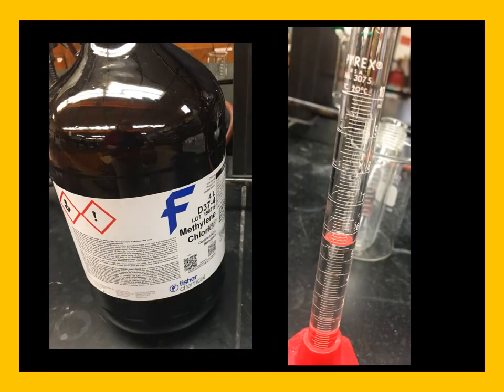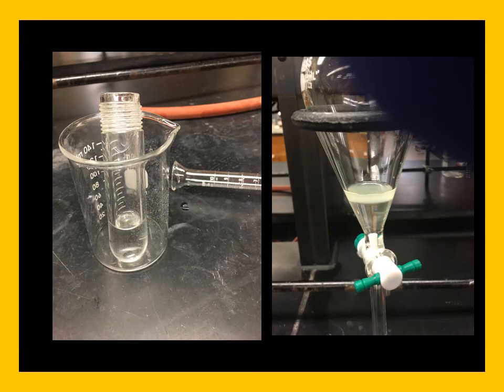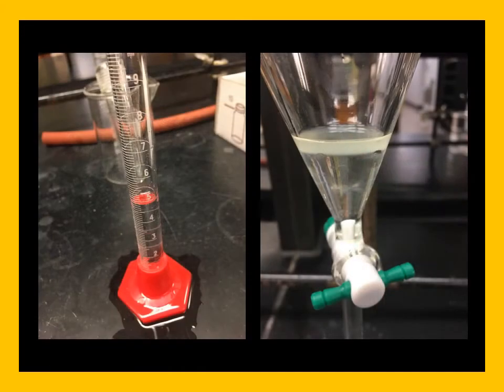Now I'm going to transfer my product into my separatory funnel, and I have now weighed out 5.5 mils of methylene chloride or dichloromethane. I'm using that 5.5 mils to rinse any of my product into my separatory funnel, which you see here. You can see the two layers, the dichloromethane and the aqueous layer on top of it. And I'm now going to repeat that process with about 4.8 mils of dichloromethane, and we can now see that our organic layer on the bottom has become larger.